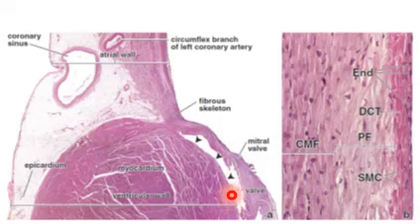We magnify this area in this section. In B, we magnify this area. As we can see, the most inner layer from here up to here is the endocardium. The endocardium has three layers. These are the endothelial cells. Those are the nuclei of the endothelial cells, flattened nuclei, and they line the cavity of the heart. And this is the dense connective tissue layer. DCT stands for dense connective tissue layer, from here up to here.